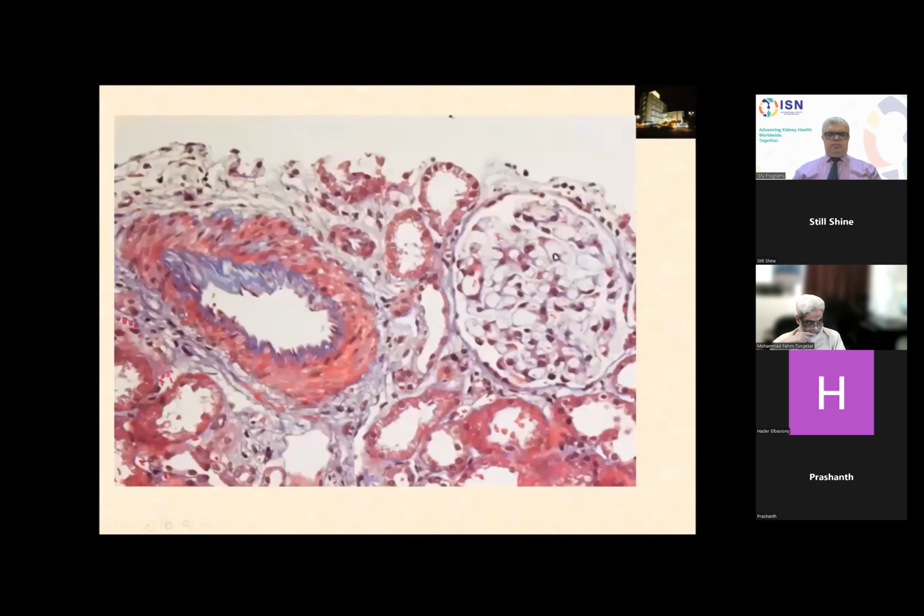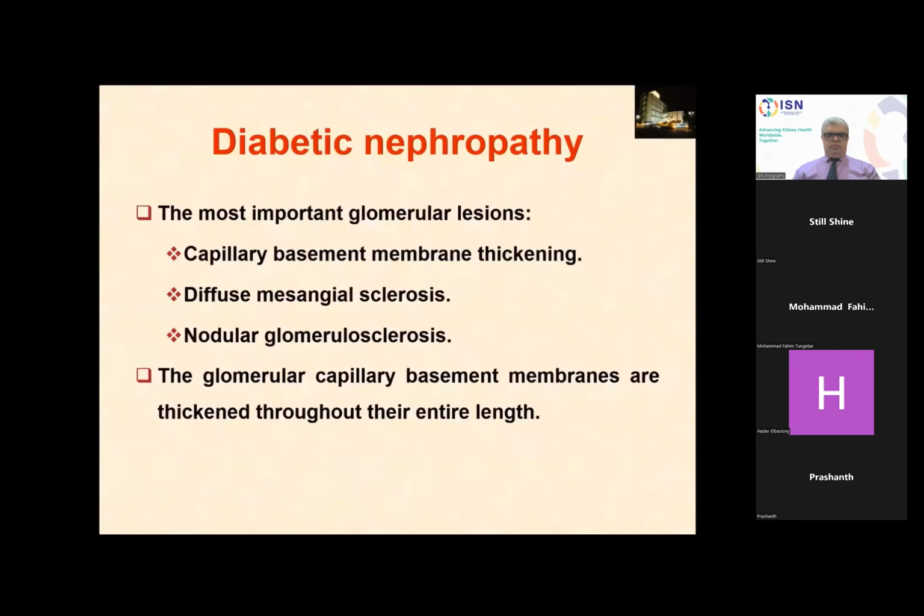We have no glomerular alteration, but this artery is remarkable for myofibrointimal proliferation, and here we consider this segment normal. We have the onion skin or smooth muscle proliferation here and here, associated with fibroedematous or intimal fibrosis, and this is an example of a hypertensive vascular disease. And the second most common item in this group of chronic renal failure, these being the two most common causes of chronic renal failure, are hypertensive renal vascular disease and diabetic nephropathy.